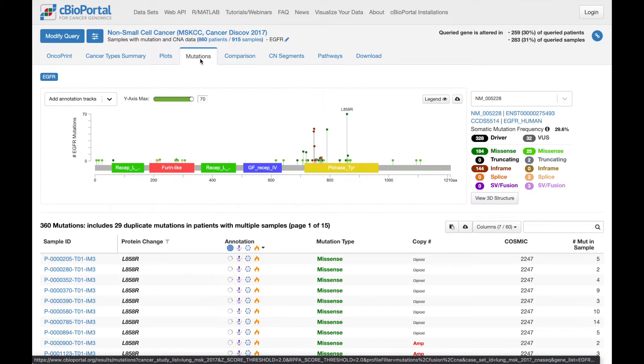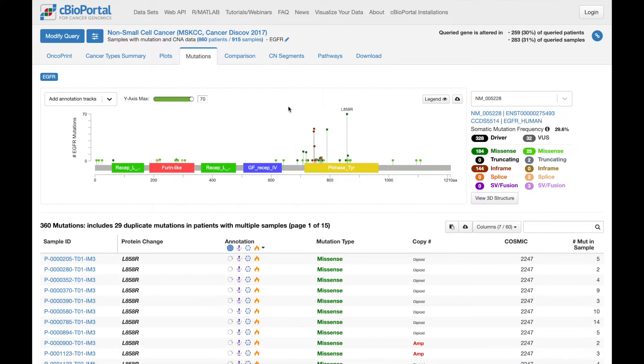We can see quite a few recurrent mutations in the lollipop plot, and the one I'd like to focus on is this one, T790M.